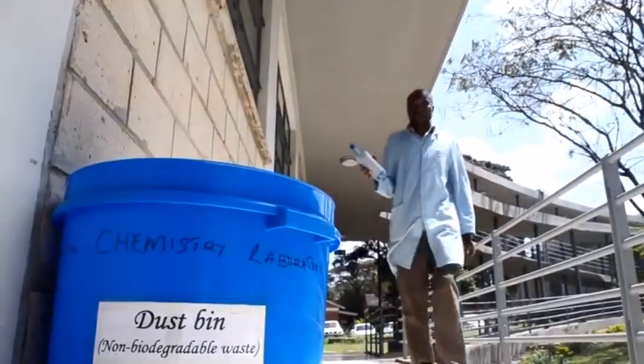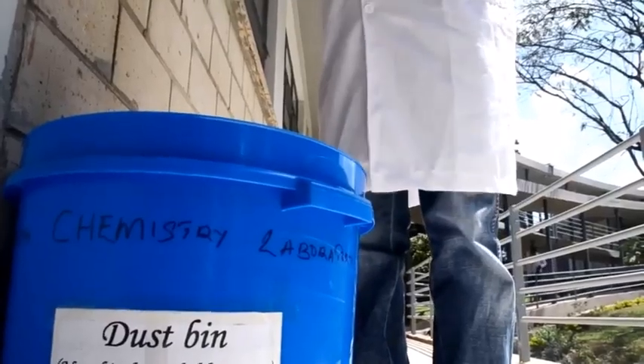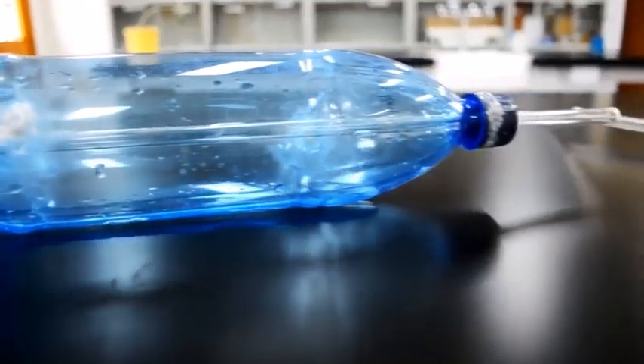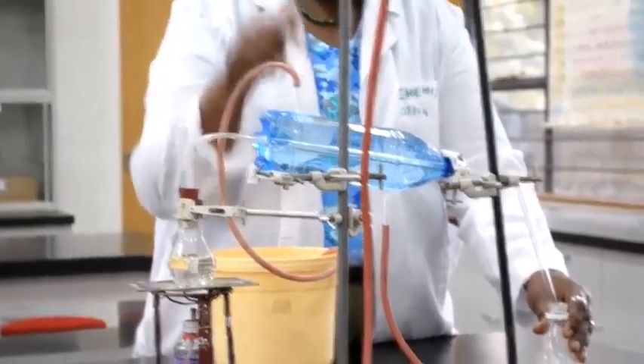The teachers in those schools would prefer to teach the students theoretically. So we have come up with an improvised Liebig condenser where we use a mineral water bottle, and it works just in the same way as a conventional Liebig condenser.